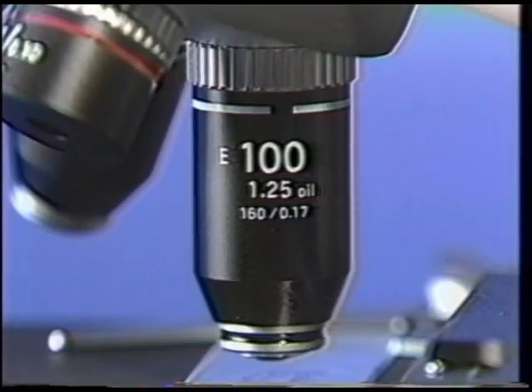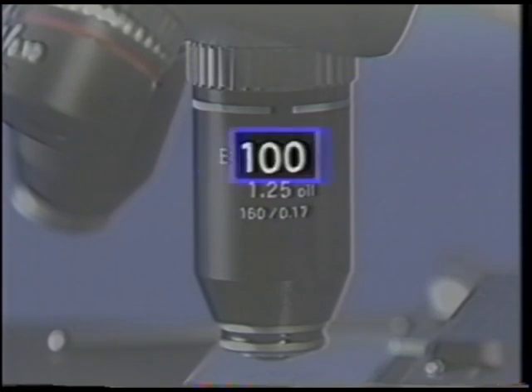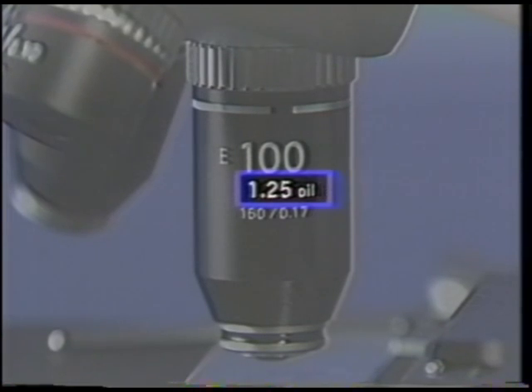Each objective is clearly marked with a colored ring designating the magnification. On the microscope barrel, other specifications are listed, such as objective type, magnification, numerical aperture — which indicates the lens's light gathering abilities — mechanical tube length, and cover glass thickness correction.